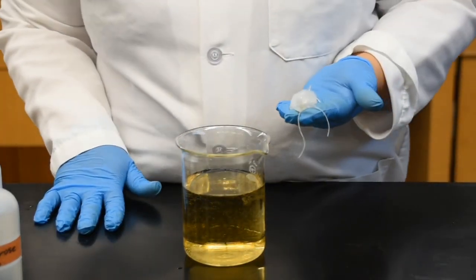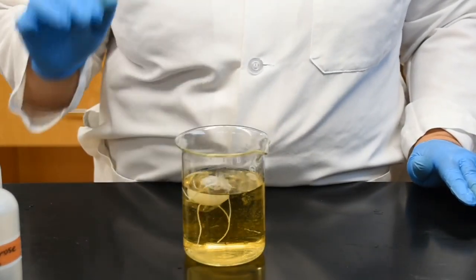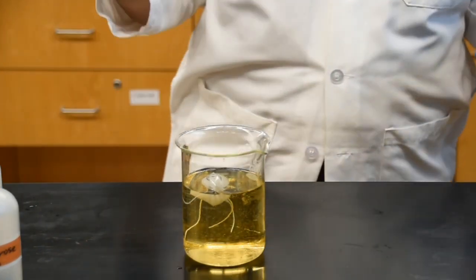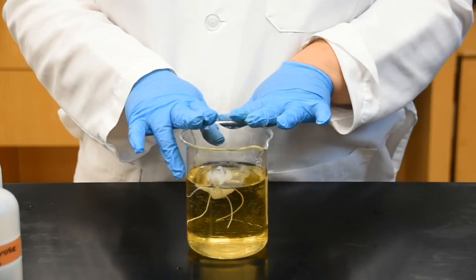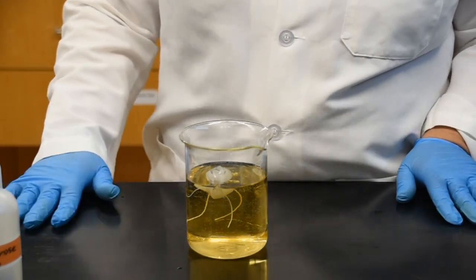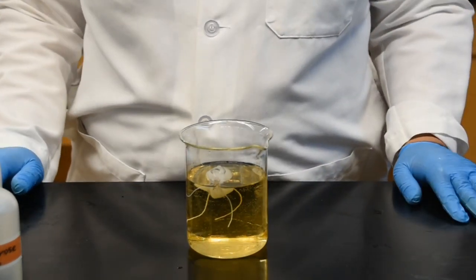So what our experiment is going to do is we're going to take this baggie and place it inside our Lugol iodine water and observe the final result. So let's look at it in terms of prediction. If the starch baggie gains weight, that is usually an indication of water molecules diffusing, using osmosis, to get into my baggie, therefore making my baggie heavier.